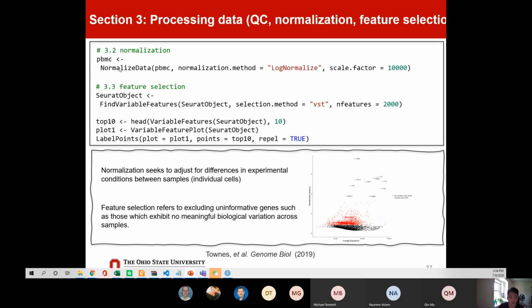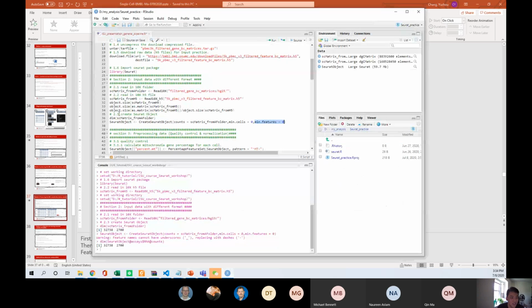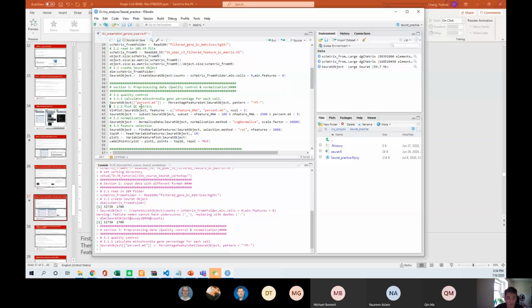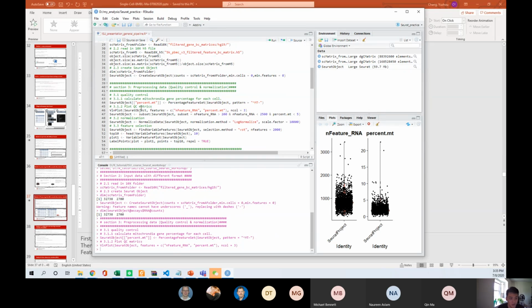And if you're running this code, oh, sorry, I forgot I ran this code simultaneously. My bad. I should run this one. If anyone runs this code and has any issue, just pop out and raise your hand, so I can figure out what question you have.